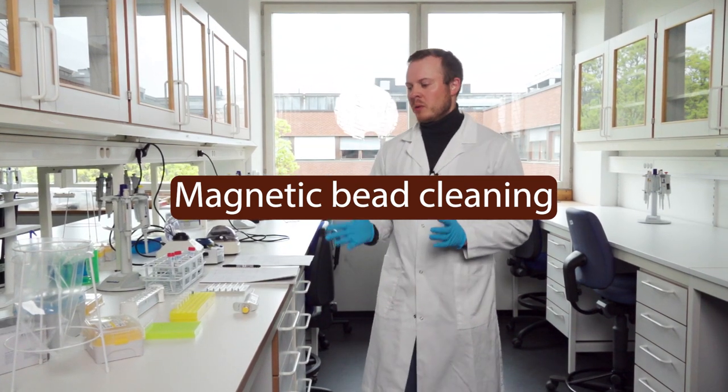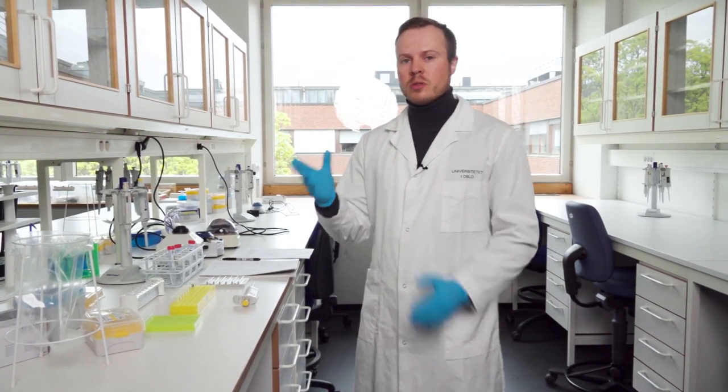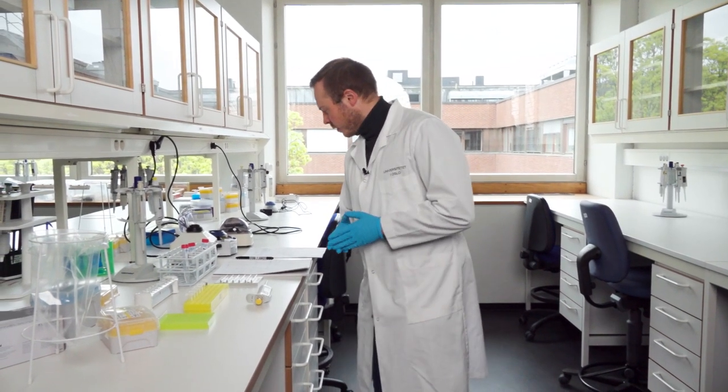Welcome to a new episode on how to do the two-step PCR procedure. In the last part we ran a gel and went through the different results you can get. Now the next step is the PCR bead cleaning.